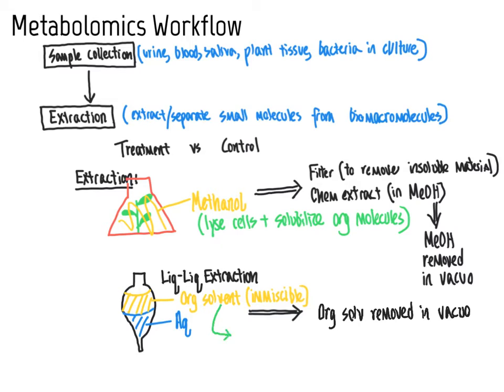It has to be able to be separated from water. And so common organic solvents here are things like ethyl acetate, an ester, hexane, or other alkanes, and a variety of other organic solvents as well, such as chloroform, dichloromethane, and others.